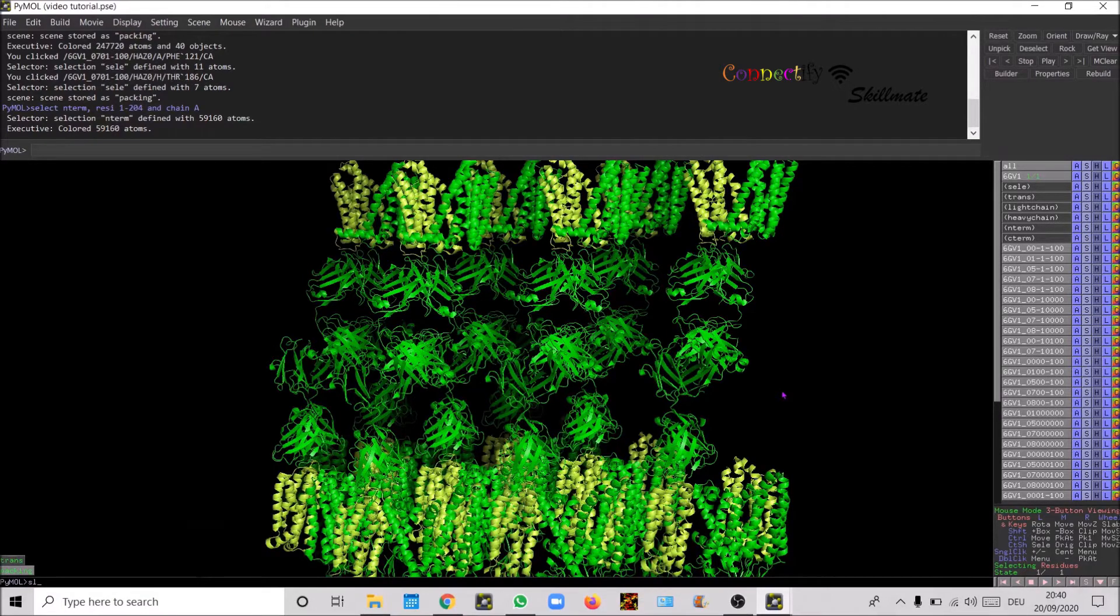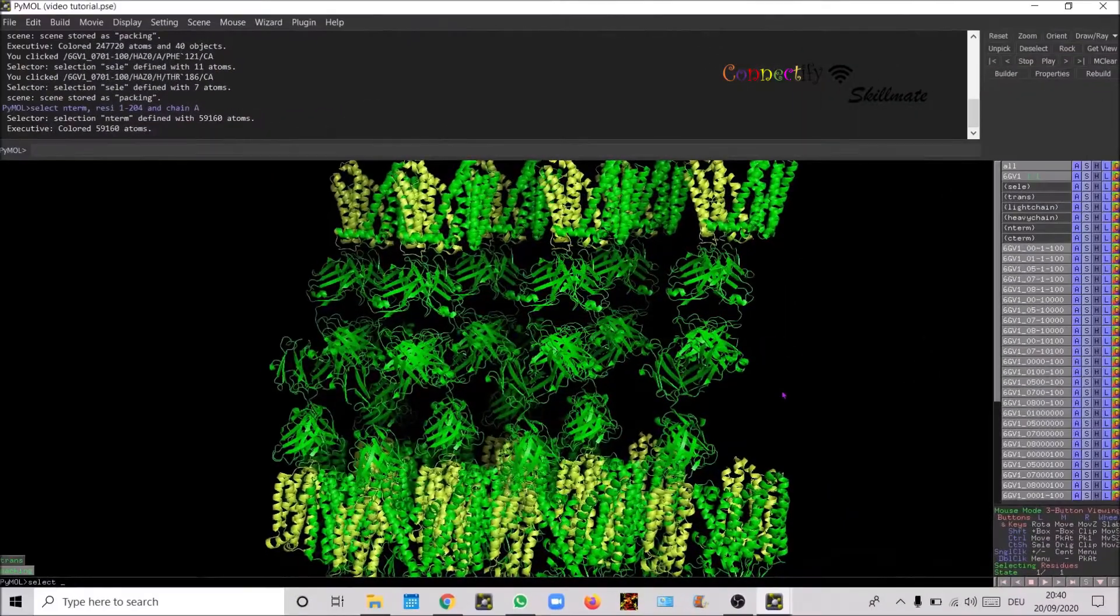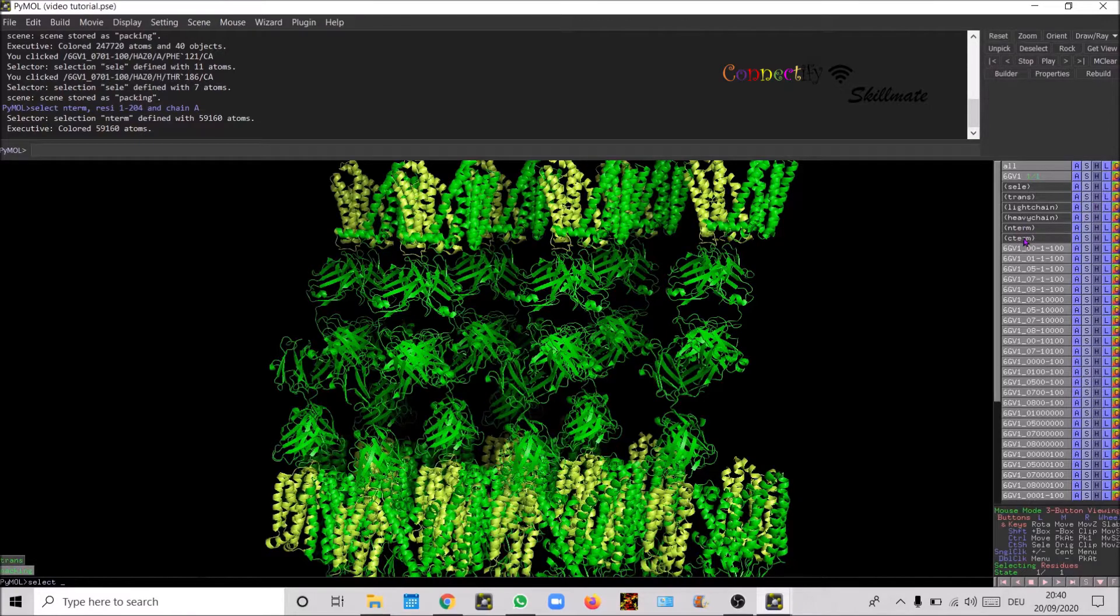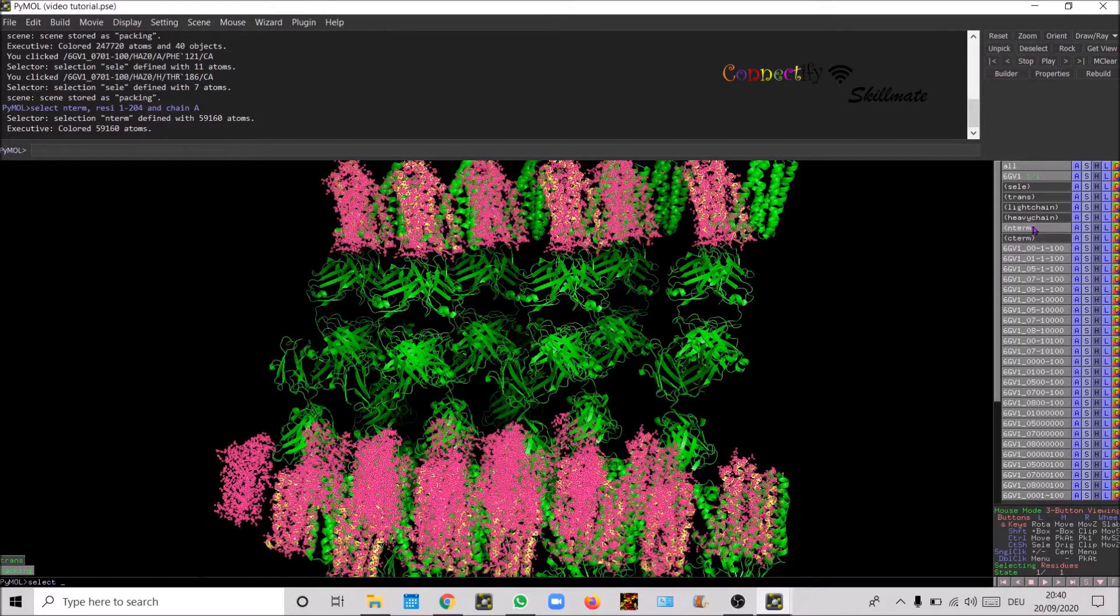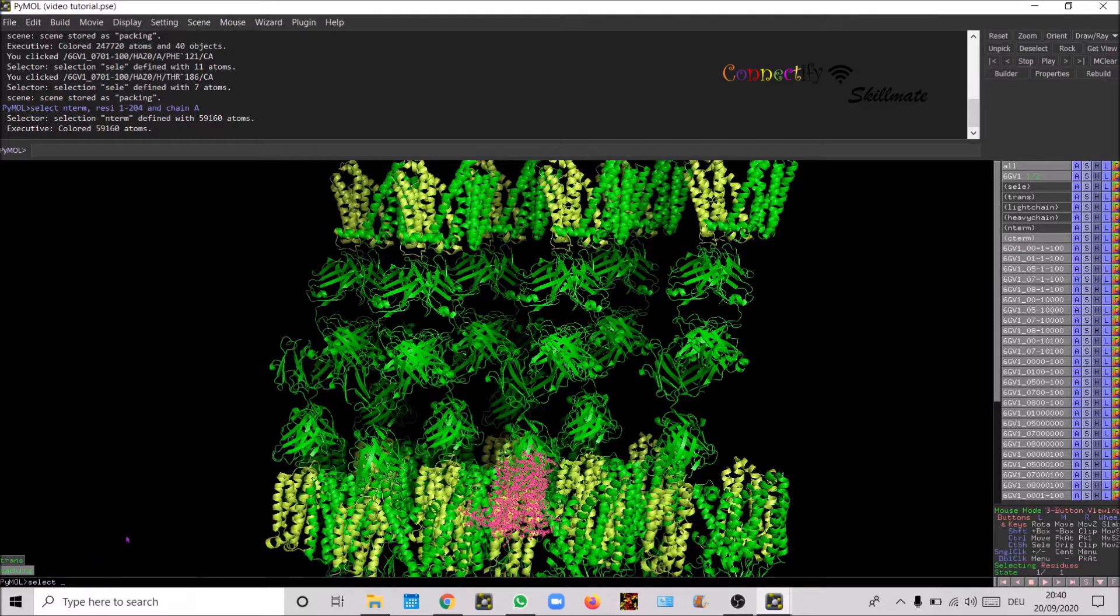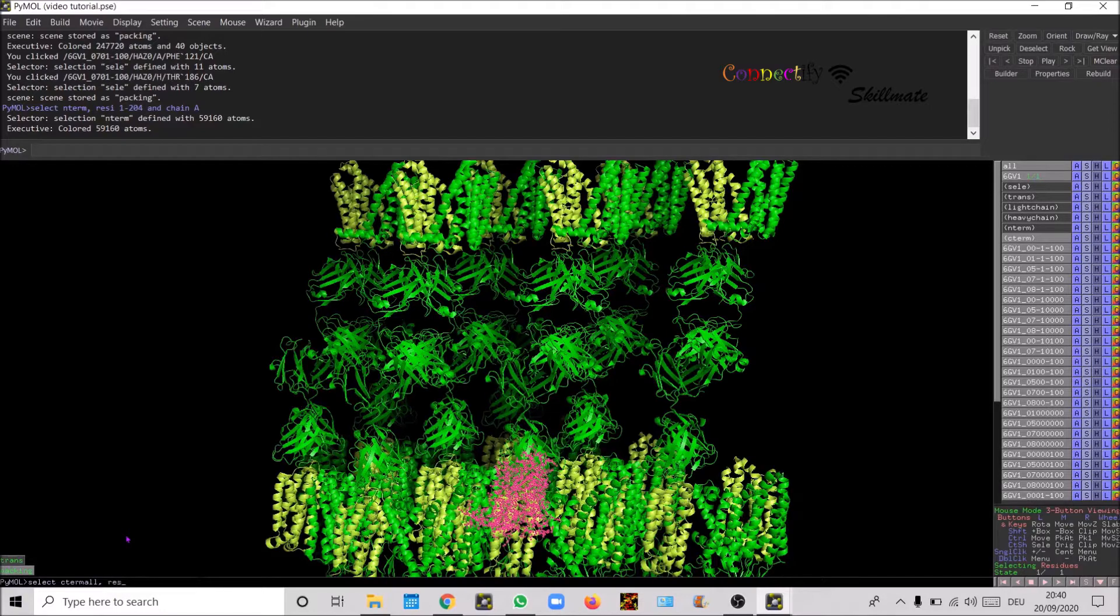Now let's define selection for the C-term. This is going to override the previous selection that you have already made which was only for one particular molecule. You can give a different name for the object. Let's say define C-term all and then define residue, so it's 205 to 400.